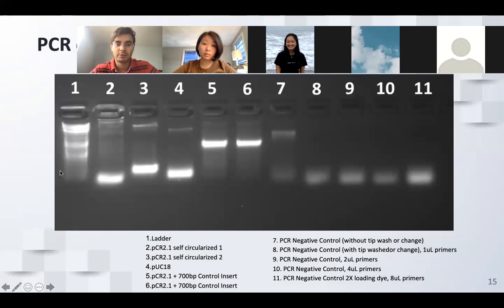In the gel electrophoresis, we have a lane with markers, which are molecules of DNA with known sizes in terms of their length.